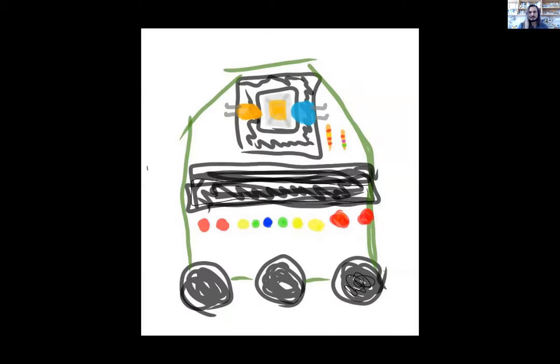So I started designing: we're going to hold the LEDs and the light sensor here, and we're going to use 10 LEDs to denote the optical density in units. And then we're going to use this one interesting chip. It came out in the 80s, and it's a decade voltage divider. Essentially you give it a voltage, and it will output 10 evenly cut levels of that voltage, and it compares your input and turns on lights. It's essentially a bar graph LED driver. It's super, super cheap. It's entirely analog. There's absolutely no programming necessary.